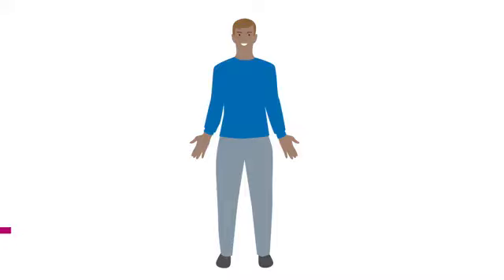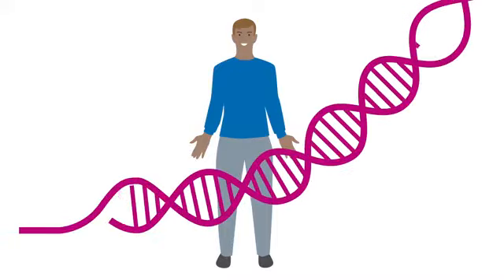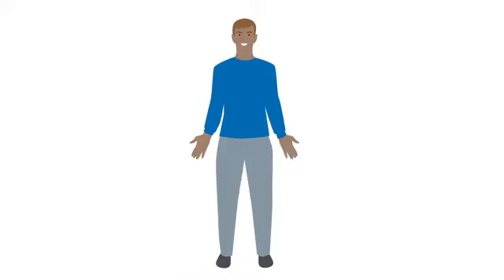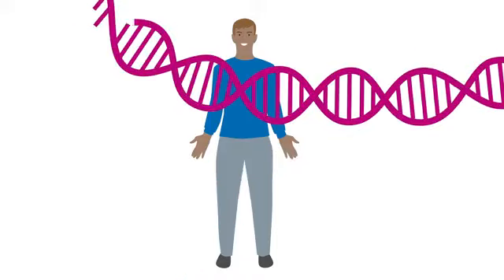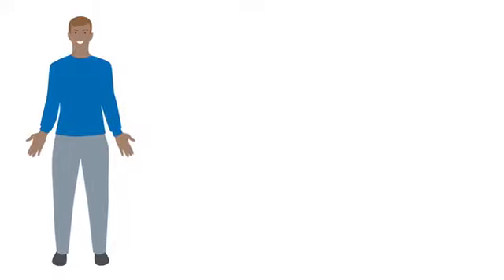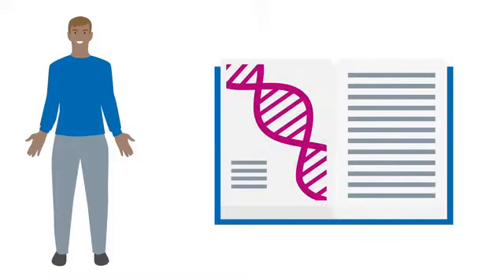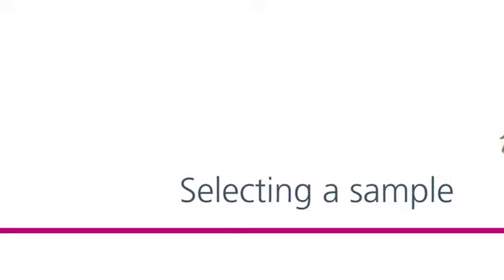Whole genome sequencing allows us to read the DNA sequence of an entire genome, including both the genes and all the other DNA. But how do we get from a patient sample to a genomic report that can help inform patient care? Let's start with the sample.